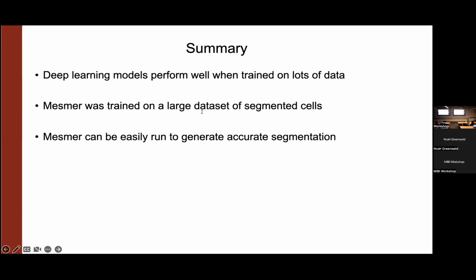Okay, how does Mesmer compare to the S3 segmenter, Elastic, a bunch of other acronyms? Are there different use cases for each of the algorithms? Has anyone checked on some or many tissues?